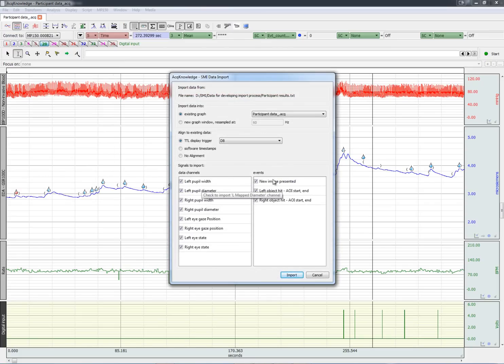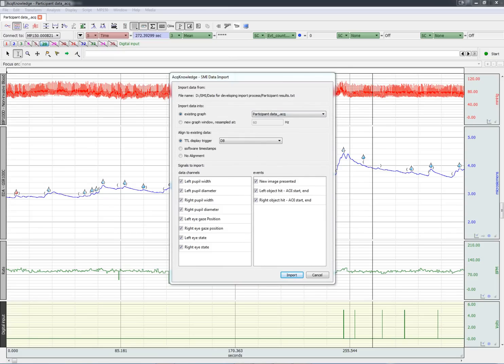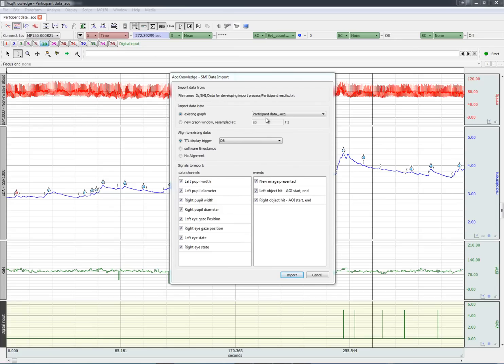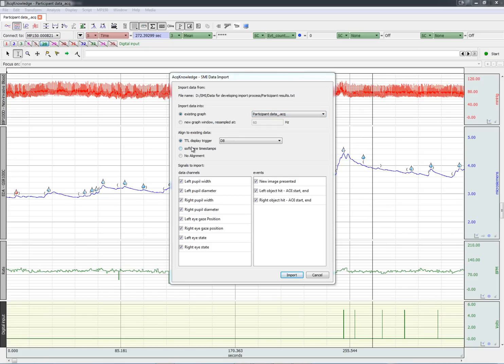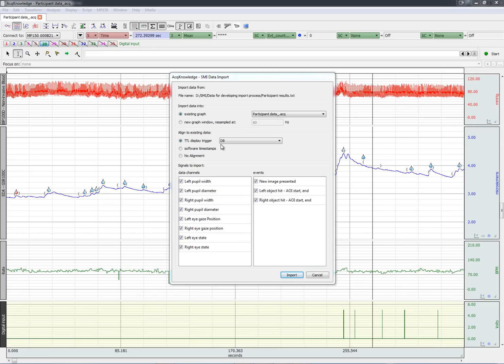Now we have a number of options. What we'll do in this case is import the eye tracking data into the physiological data record. In this case, this is the file name, participant data. And we'll use the TTL trigger on digital channel 8, that's the channel right here, to line up the eye tracking data and the physiological data.